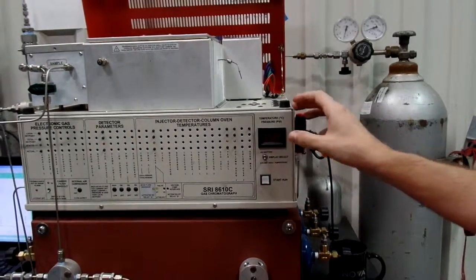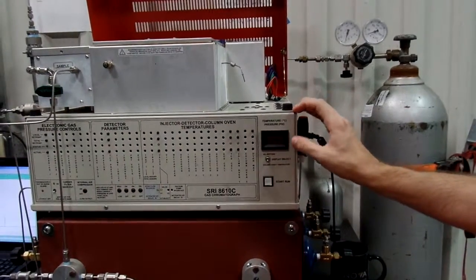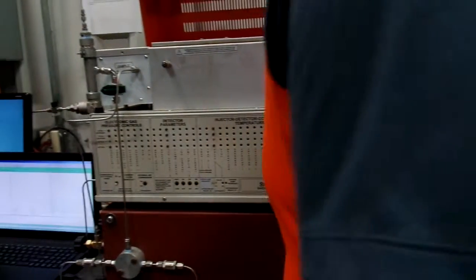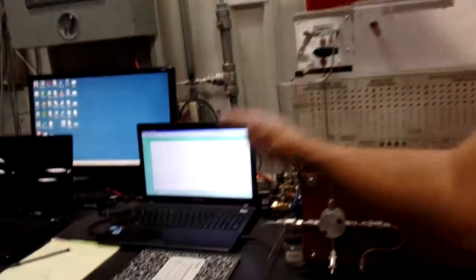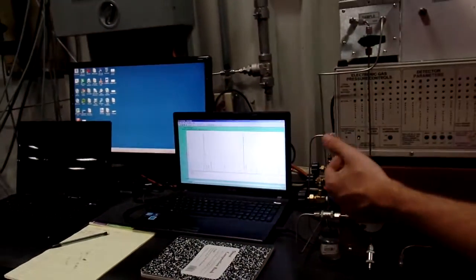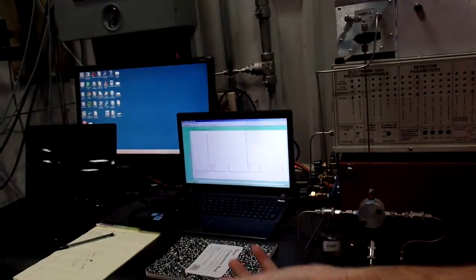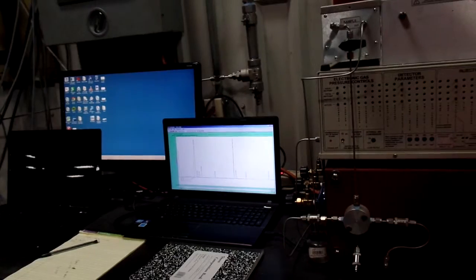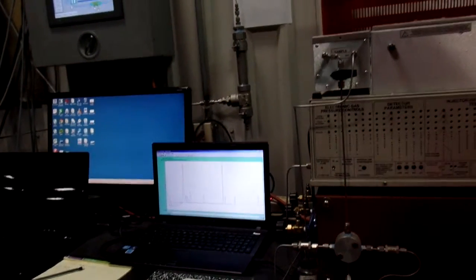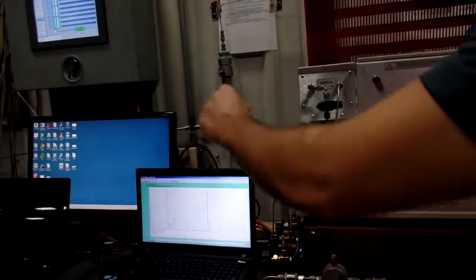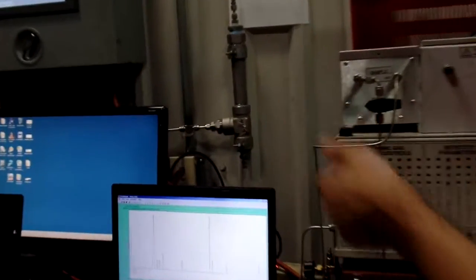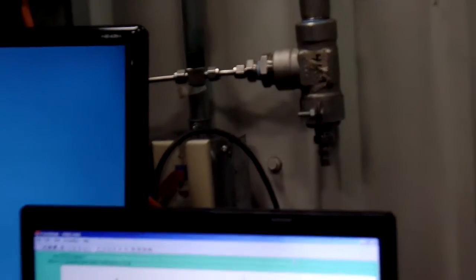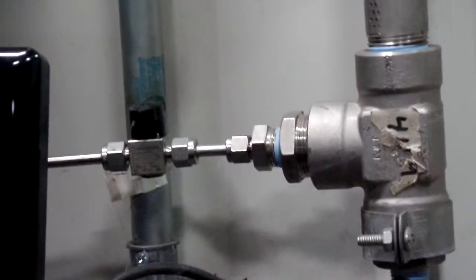All you do to run it, when you are going to test the sample, you have those valves open. You just leave them open for a few minutes. Maybe like five minutes is good enough. Shut the valves. And then you just hit the start run button. You'll hear a little ding. It's already going to start running. And you just let it sit for 30 minutes. And that's it. It'll do everything else on its own.